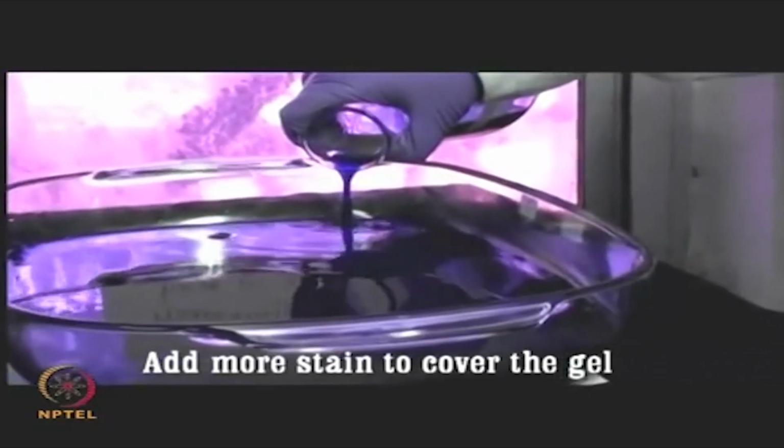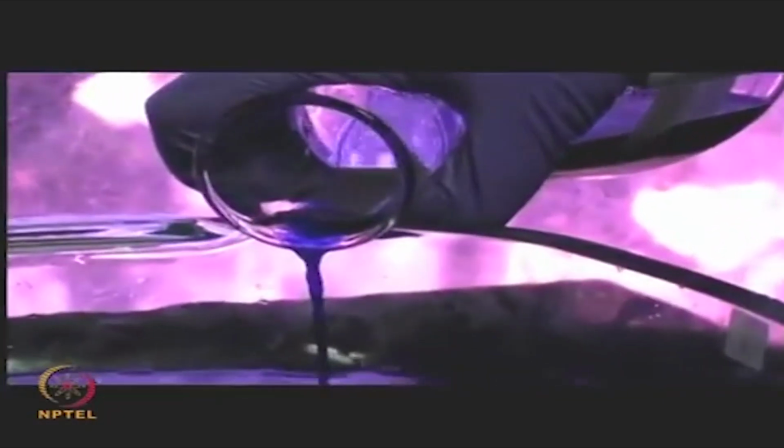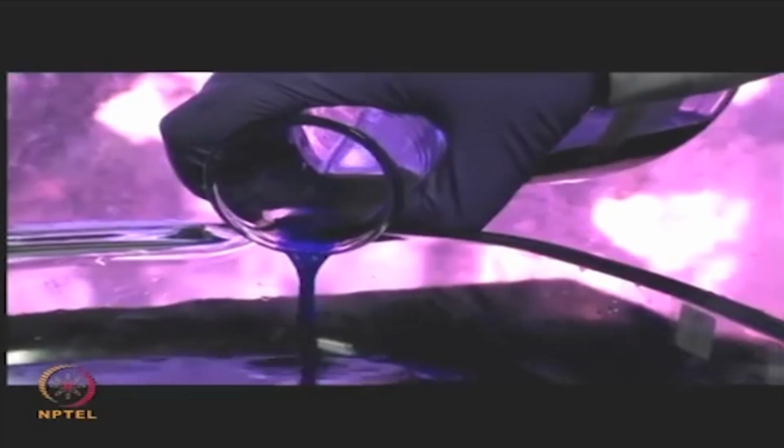Add some more staining solution such that the gel is completely immersed and leave it overnight for around 8 to 10 hours.